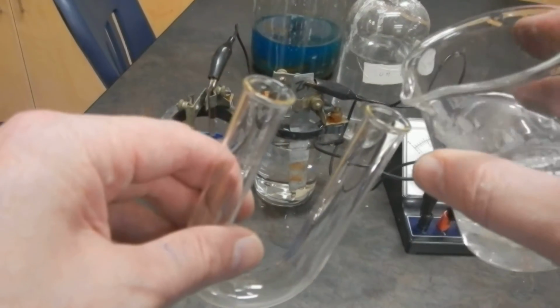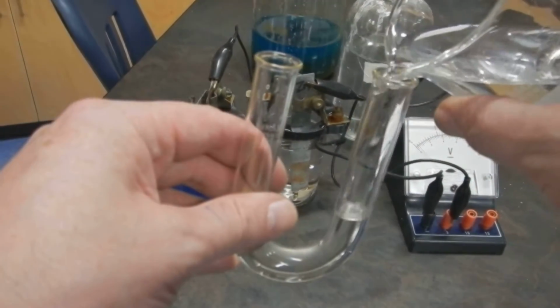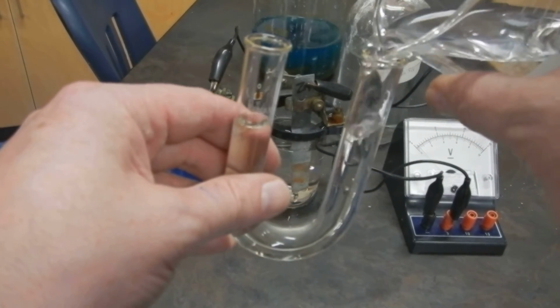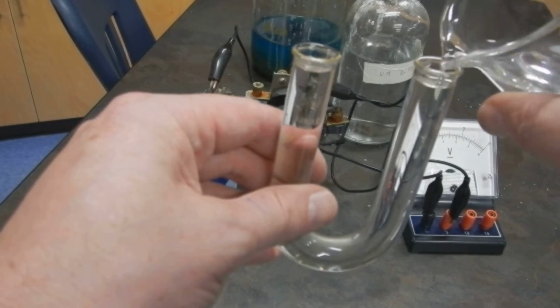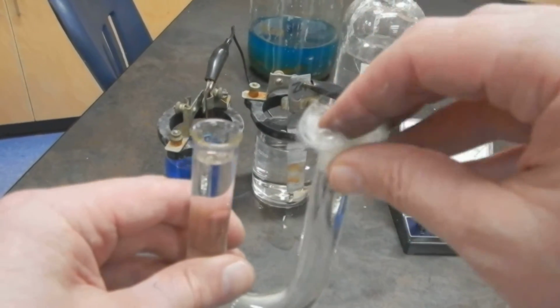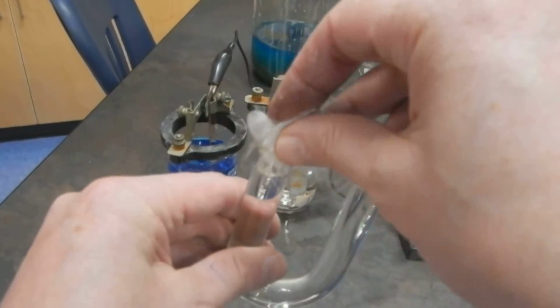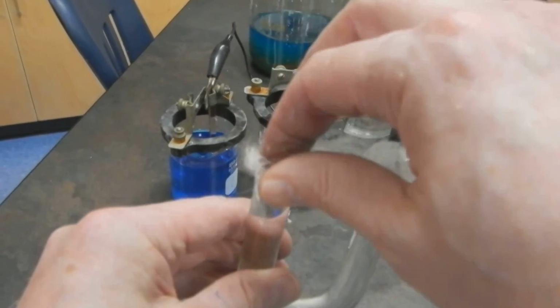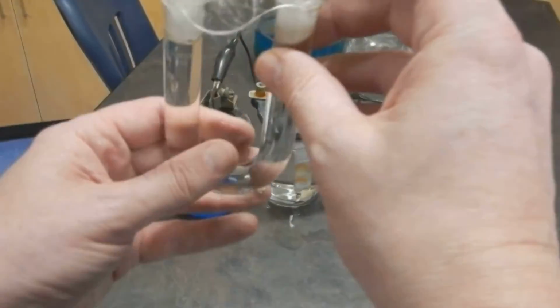So I'm going to pour in electrolyte here, and this is cleverly called a U-tube, and when we flip it over, it won't look so much like a U-tube. I guess it'll look like a little N-tube. This is just some glass wool, and inside the U-tube I put a solution to act as a salt bridge. So I got to do this carefully.